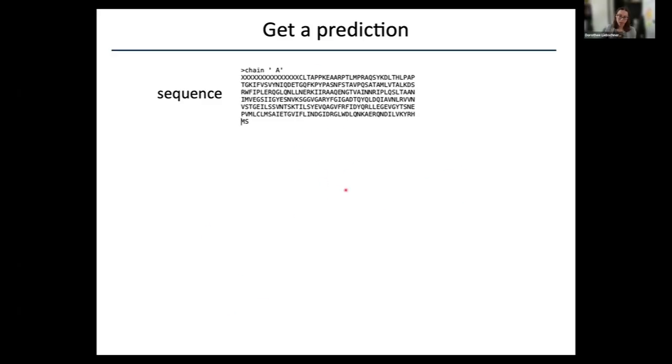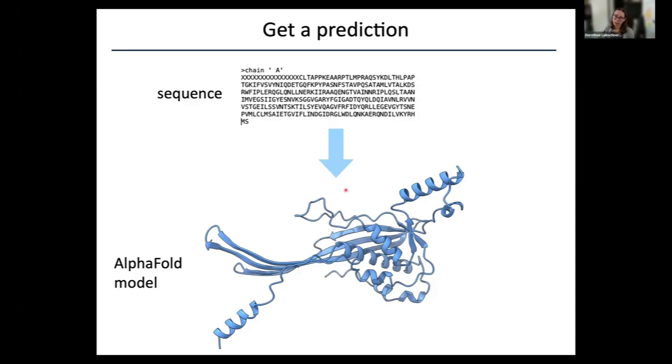All right. So I actually think it's not that bad, at least for alpha. Oh, sorry, it's a good prediction. It's similar to the cryo map. Seems like they resemble. Okay.